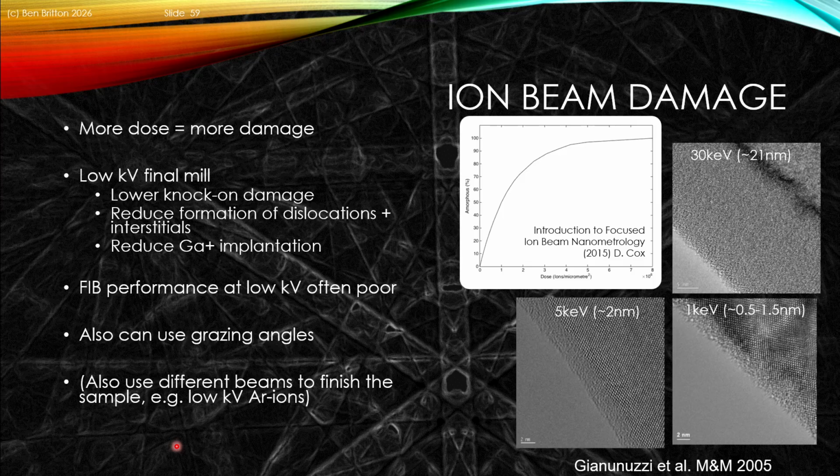We've seen that the ion beam itself can effectively create defects and ultimately create amorphous layers. Here we see that the amount of amorphization is dependent on the total dose. We get some sort of initial linear region, and then it just becomes amorphous once you've effectively moved all the atoms out of their lattice sites, their structural sites, and moved them around and sort of messed up the soup of atoms in that material. So we get a saturation of the layer in here. Ultimately, if we have more dose, we get more damage.